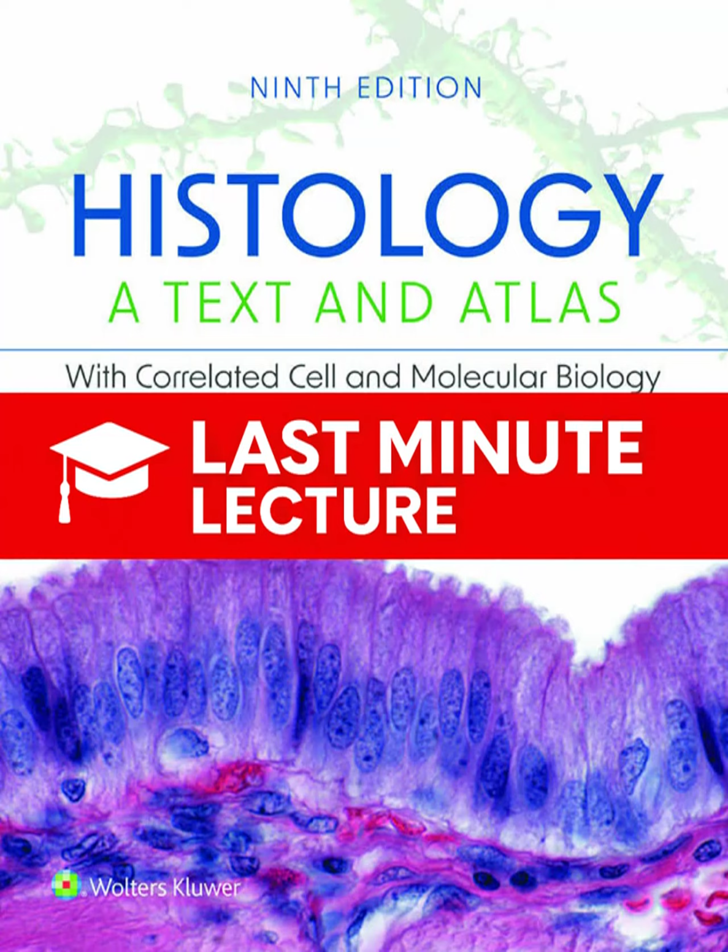And to do that, the tissue has to be fixed very gently. Very mildly, usually with an aldehyde. To preserve that fragile 3D structure, the enzyme needs to stay active. And you use a capture reagent to trap the product right where it's made. Precisely. You give the tissue the substrate for the enzyme, and you also provide a trapping agent, usually a dye or a heavy metal. This agent grabs the product and makes it precipitate immediately, right at the site of the enzyme.